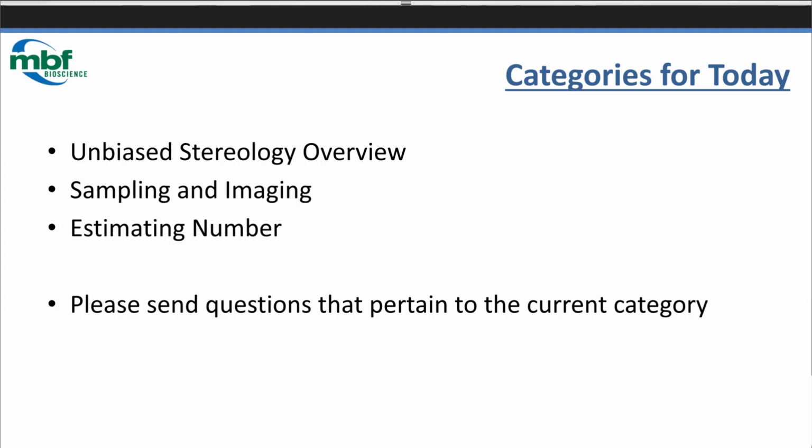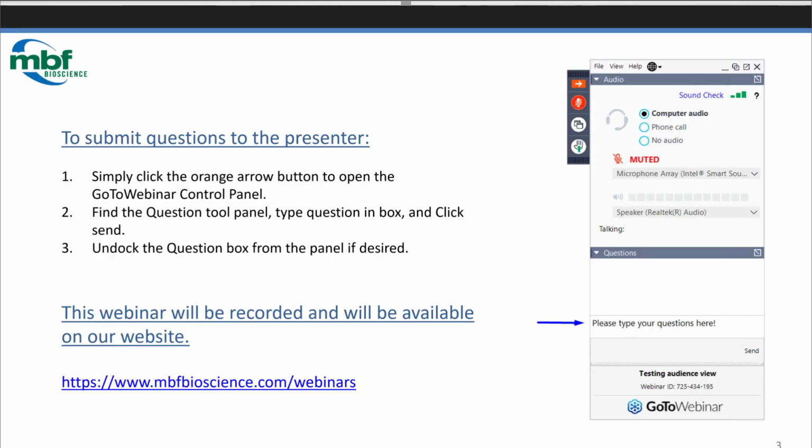I took the first 30 questions that were sent in and organized them by category. These are the categories we're going to look at: unbiased stereology overview, and then sampling and imaging, and then estimating number. So please send questions that pertain to the current category as I'm talking about one of these three categories. This is how you submit questions. You can click the orange arrow to expand the window, and then just find the question tool panel. That can be undocked if you want it to be bigger, and type your questions in.